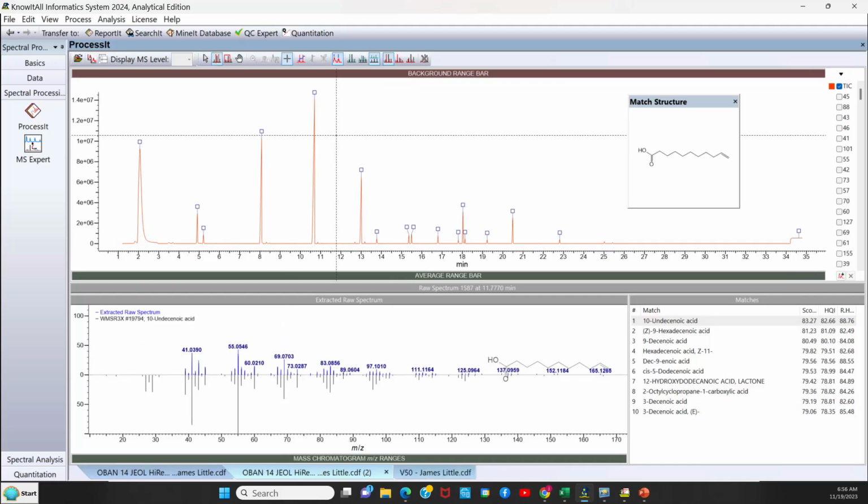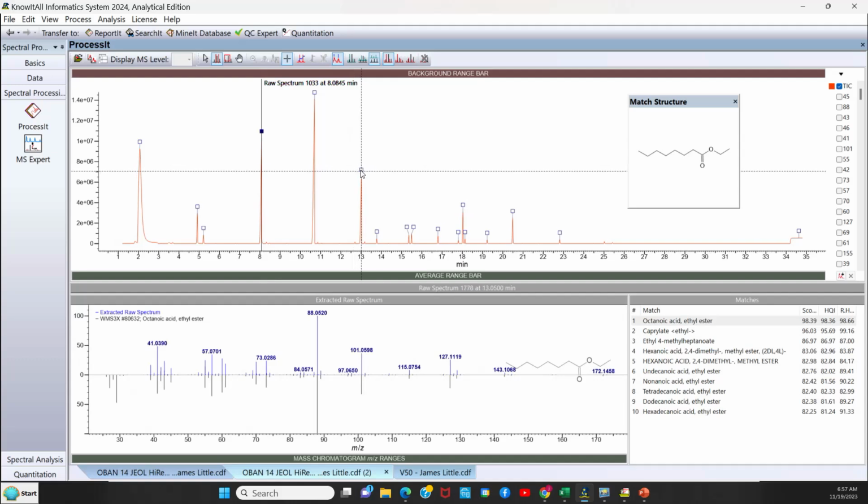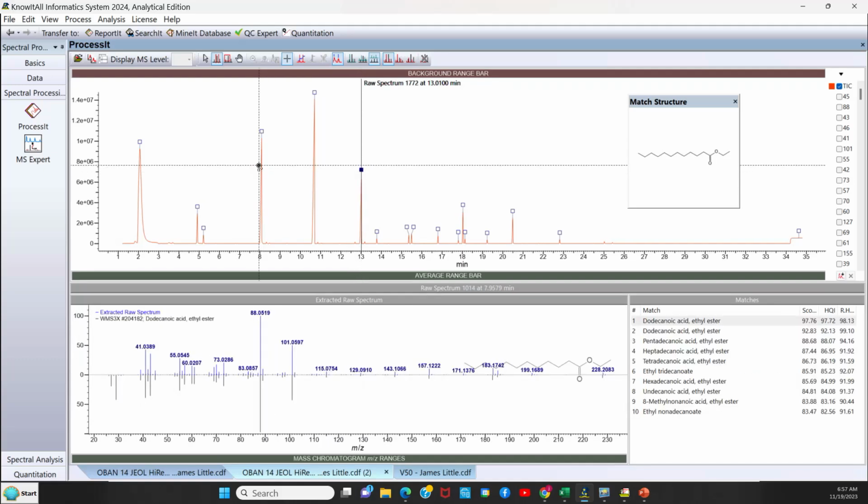So now let's talk about background subtraction. When you bring the peaks into the program and select here, let's say, these are not background corrected for maybe chemical noise here or air or electronic noise, but in most cases it doesn't matter. You can do them without doing the correction. However, if you want to do very small peaks, let's say we wanted to look at the 25 through 26 minute range and pick up these two little peaks here, you might need to do a background subtract.